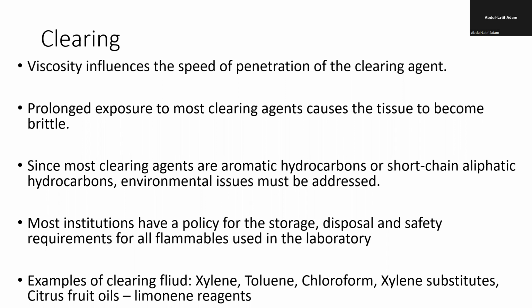Okay. And then another aspect is that overexposure to the clearing agent can also cause hardness of the tissue. So in as much as you are trying to remove the dehydrating agent, you don't keep the sample in the clearing agent for a very long time. Otherwise, it will cause the tissue to become brittle, and fragment.